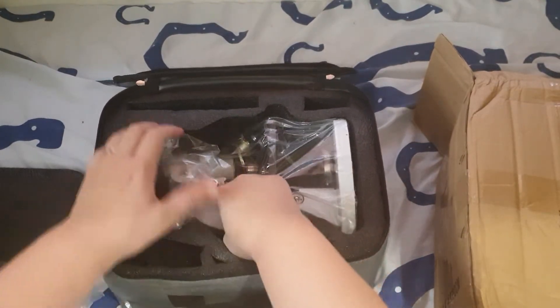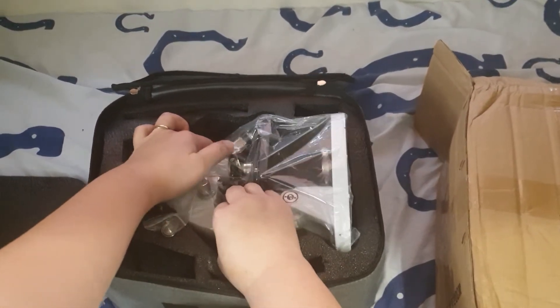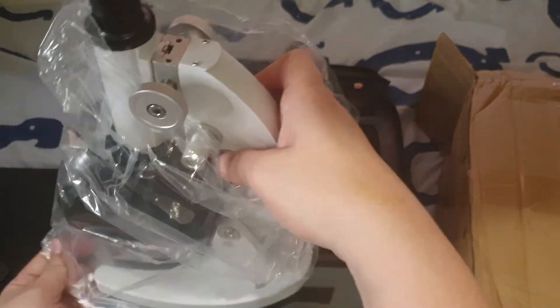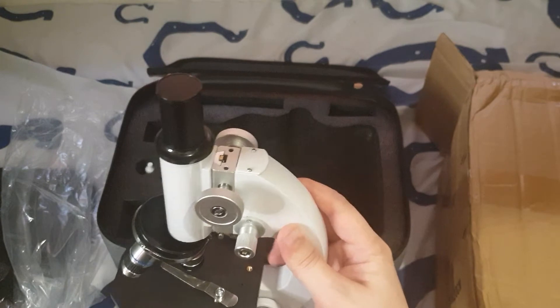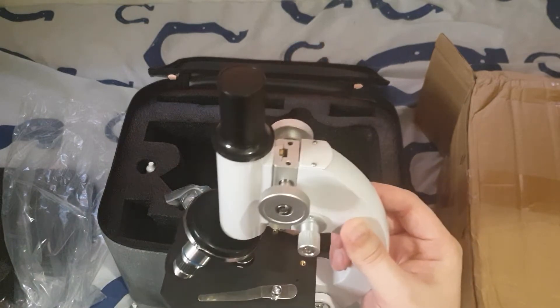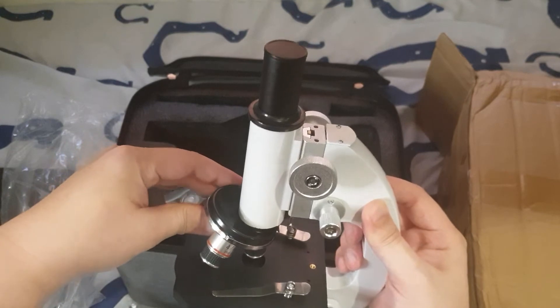You should hold it on the base and the arm — there you go, here is the microscope. It looks like it already has a stage there, so what was the other stage for? It's a three-optic microscope.